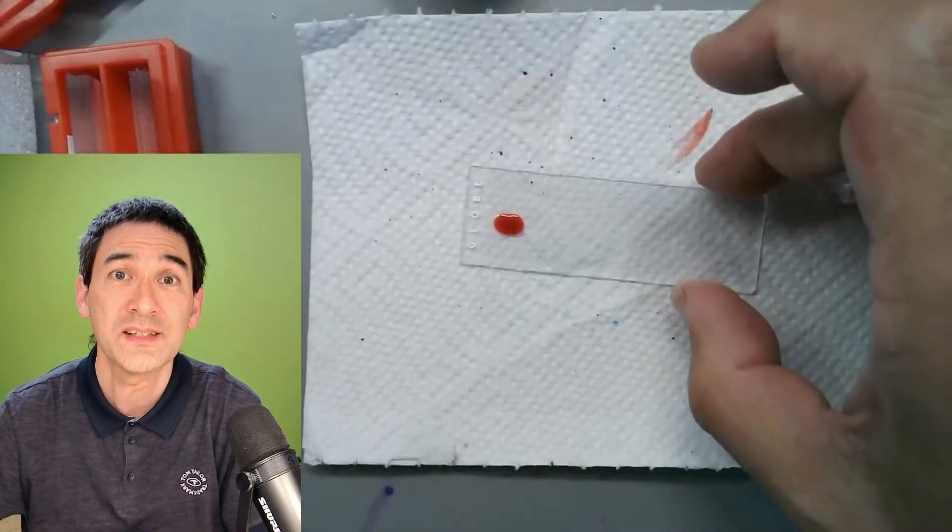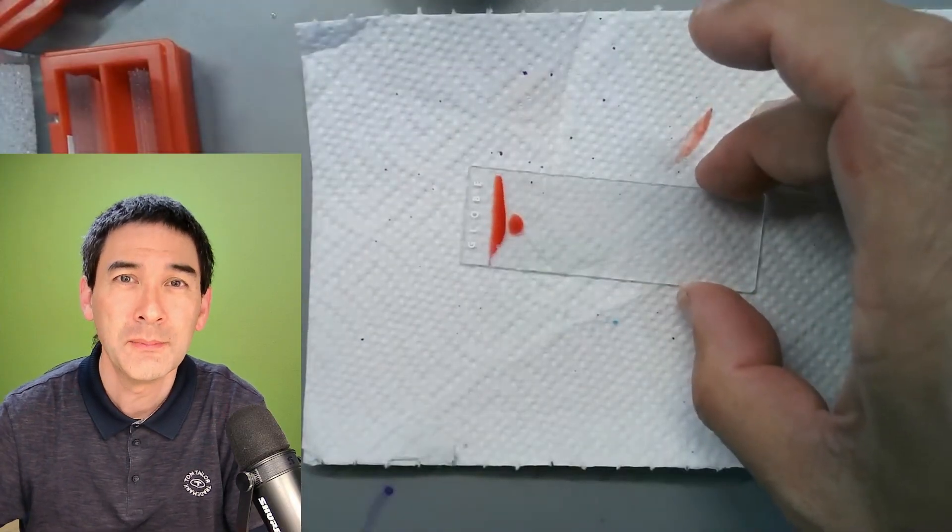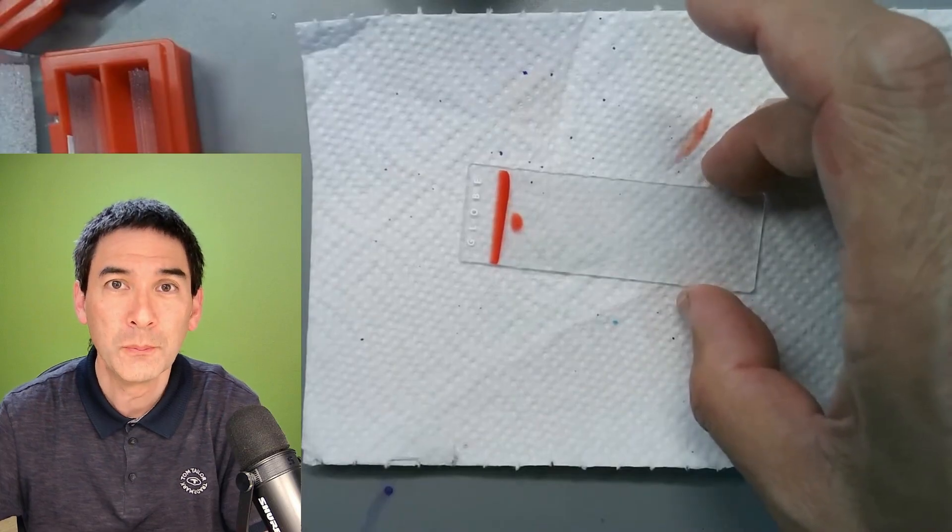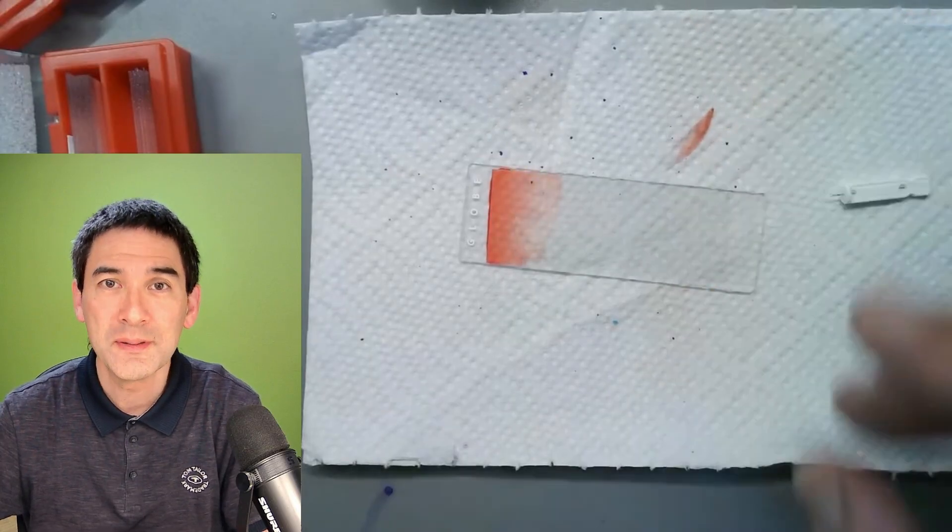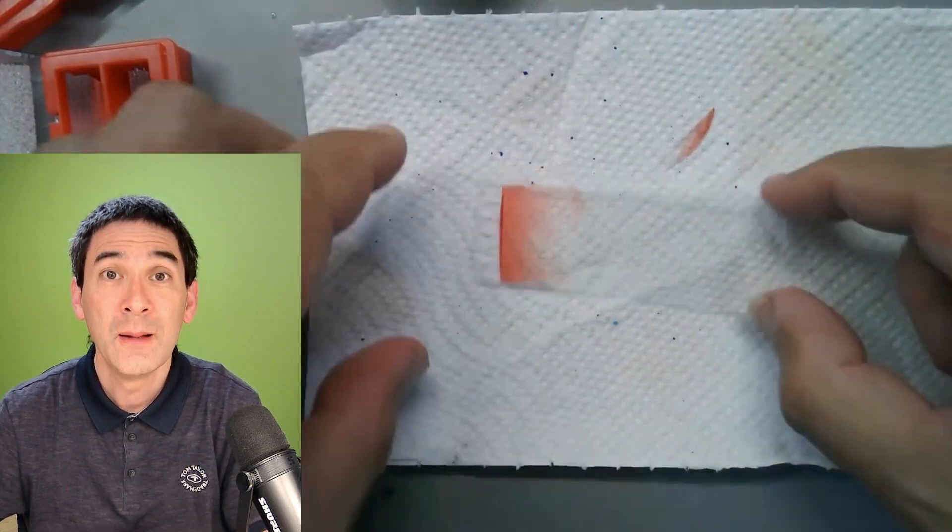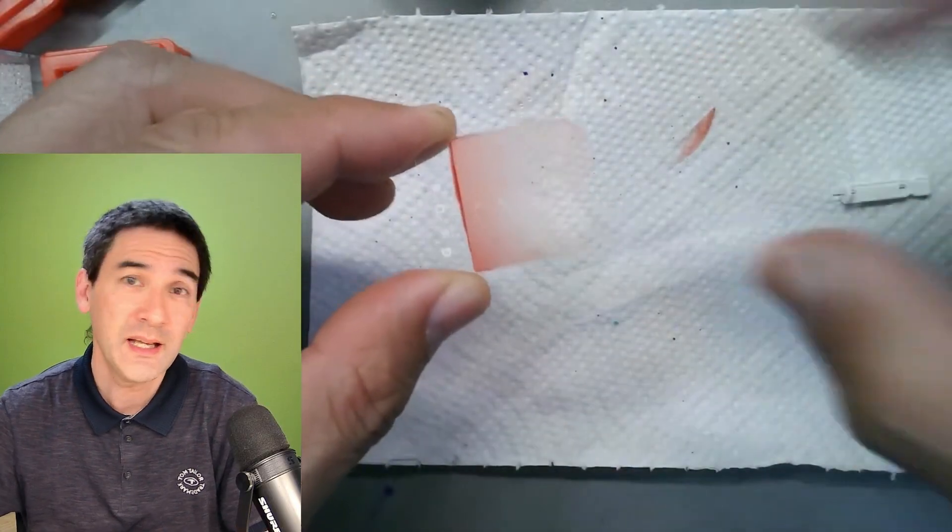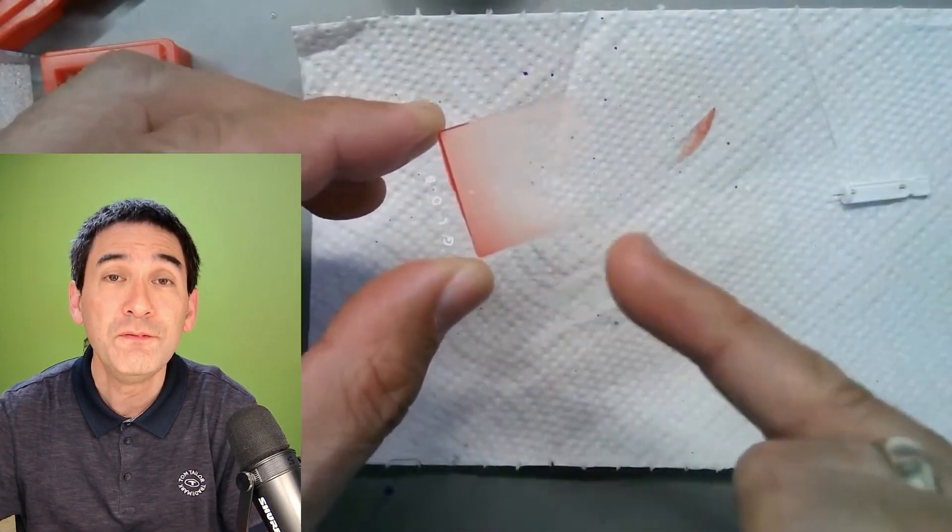Now of course you can use also the regularly sized cover glasses but then the amount of blood has to be of course much less. This one is a large one, covers almost completely the complete slide and look what happens now. Due to capillary action the blood now starts to spread beneath the cover glass and it also creates a very thin film.